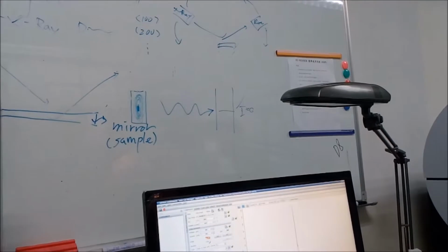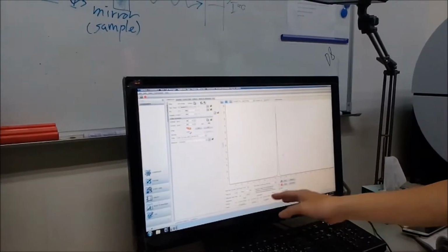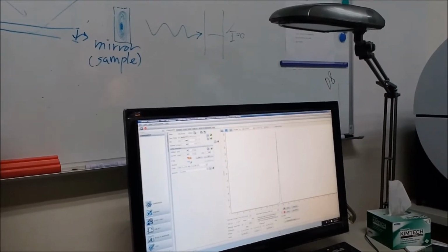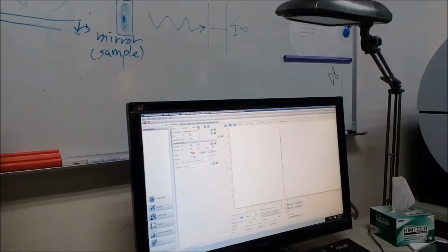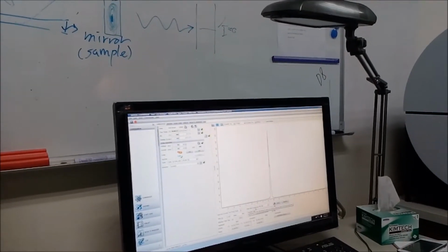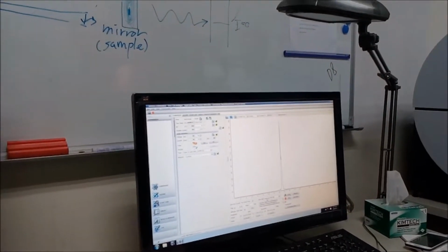If you want to see another diffraction peak, you need to set the stop angle larger, maybe 80. All of the settings are in here: your exposure time, your increment. This mechanism just lets me know what the crystal phase or diffraction peak is in this sample.